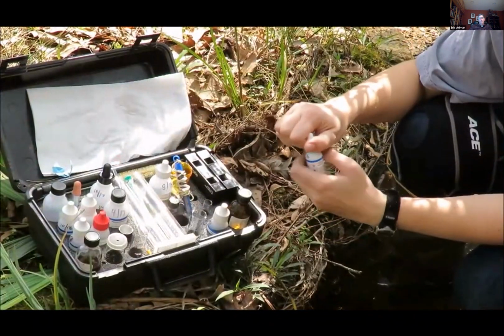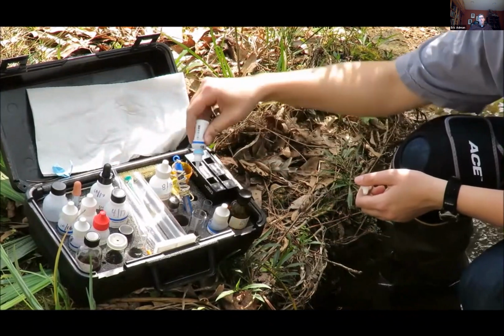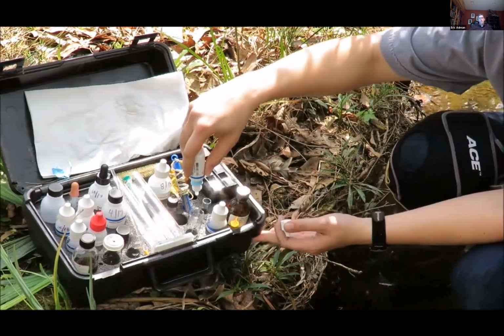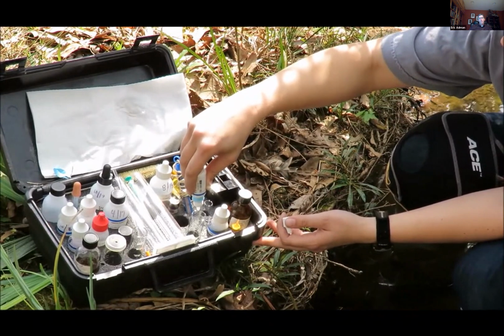Locate the hardness reagent number 5 bottle. Add 5 drops to your sample and mix. When dispensing the reagent, take care to hold the dropper bottle vertically. This ensures uniform size drops.